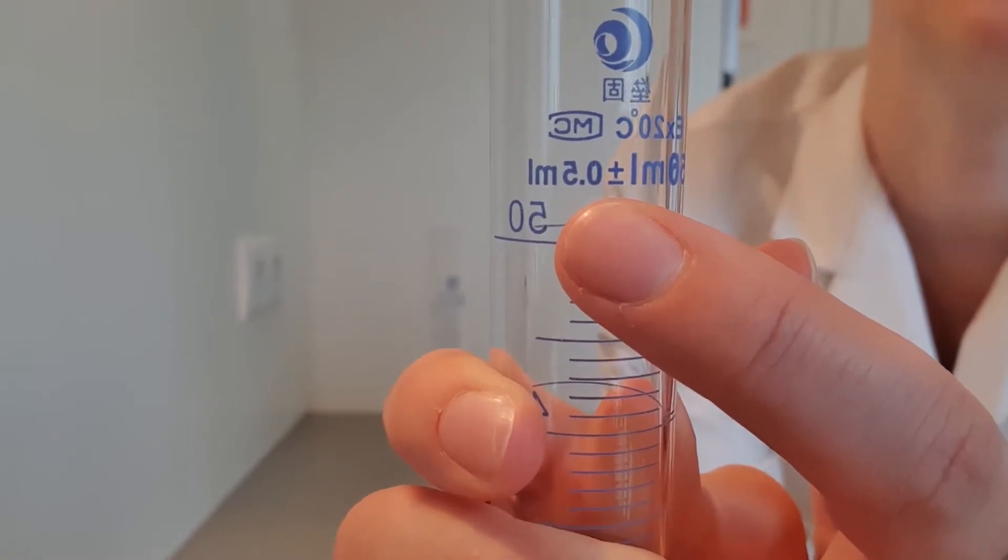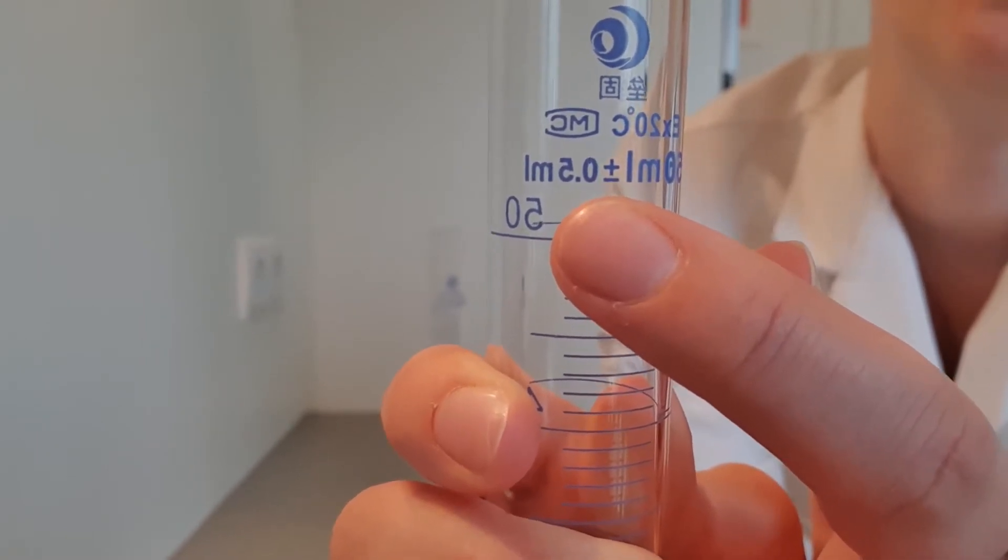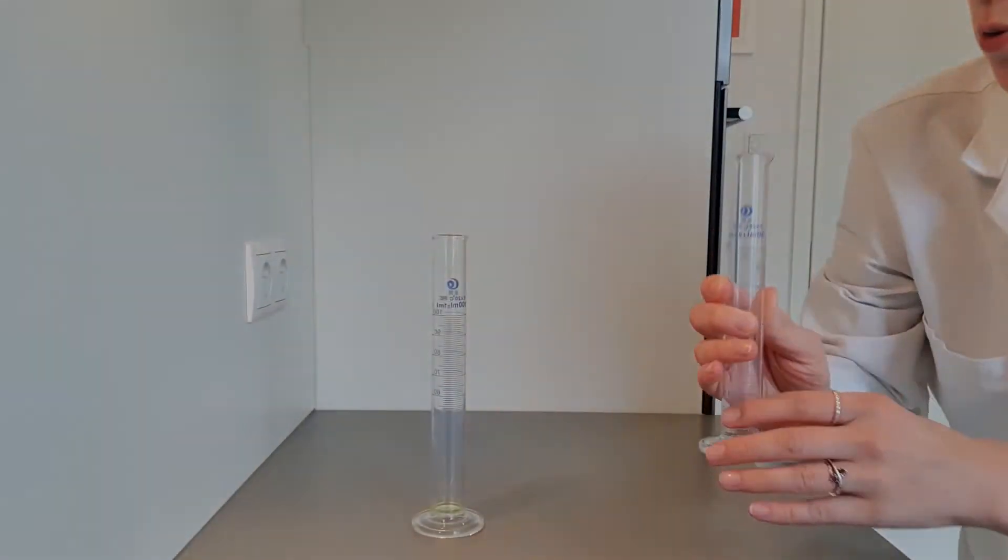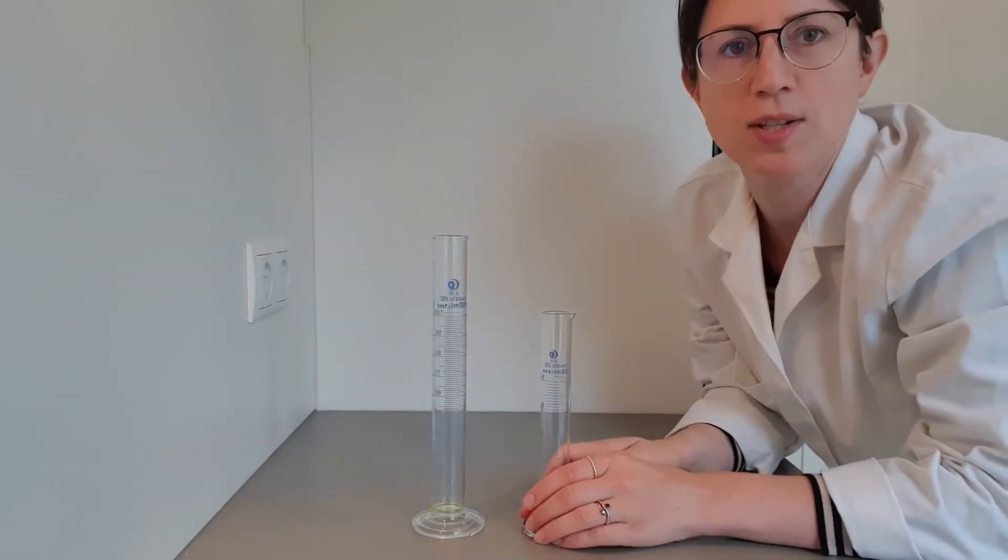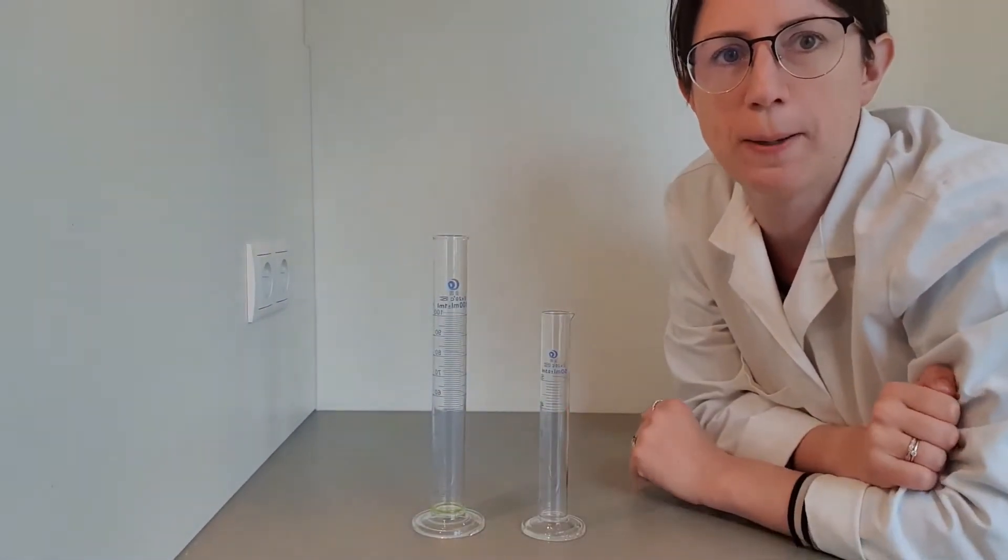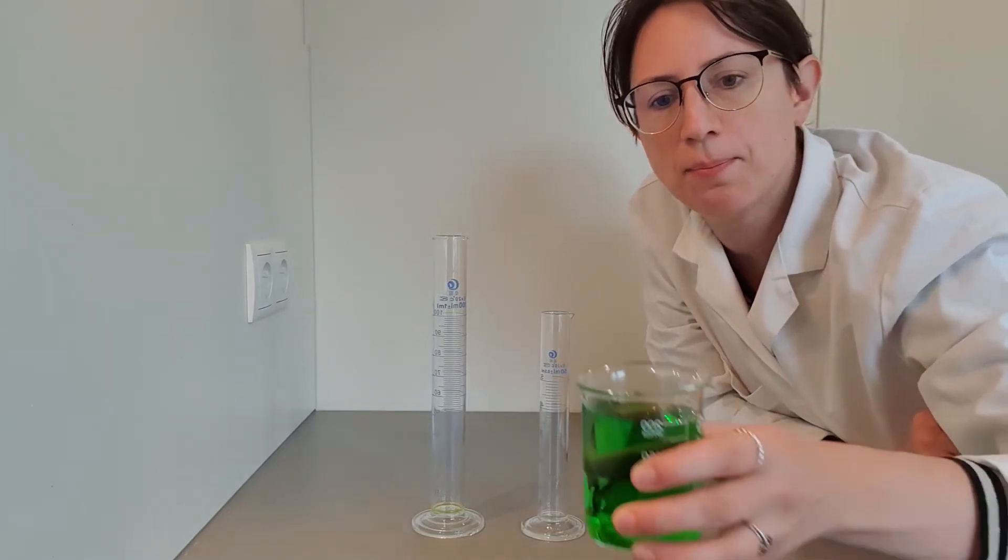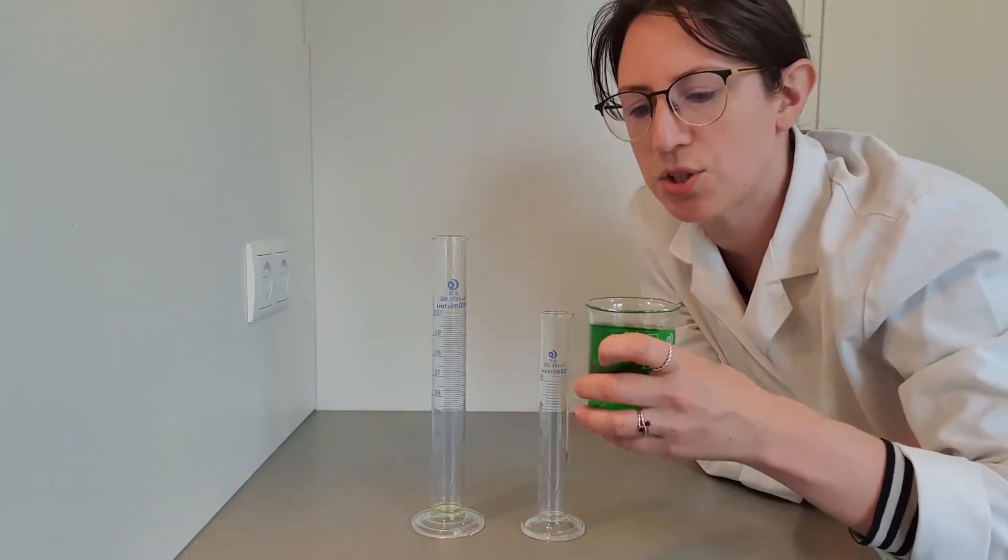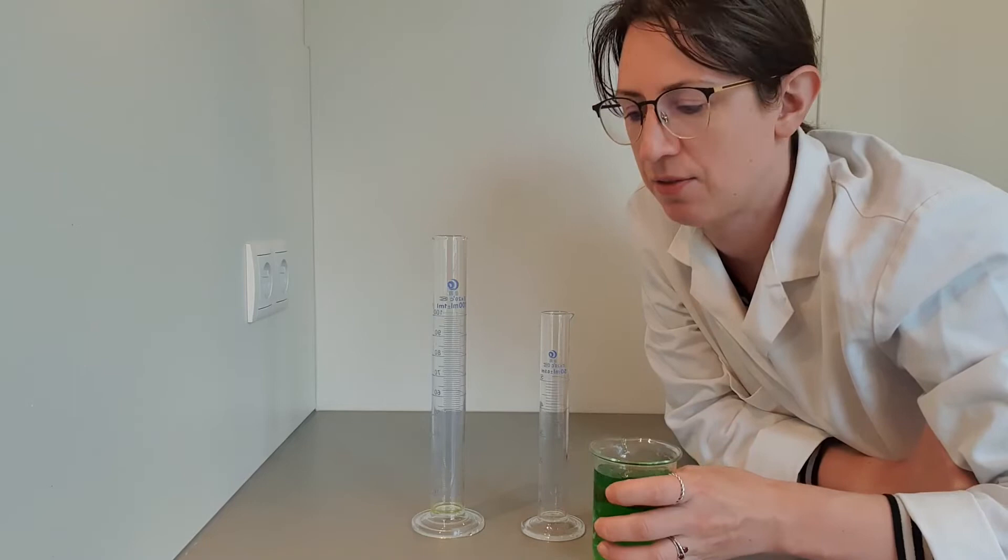So how do we use a measuring cylinder to put the correct volume in? I've got some green water here, just so you can see the clarity of the water a little bit easier.